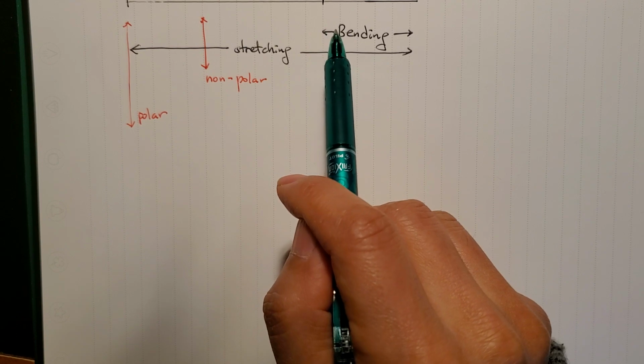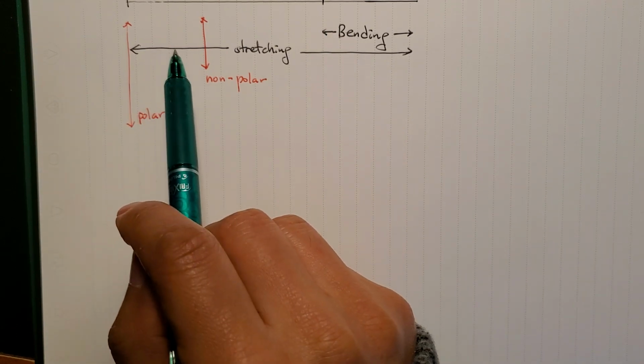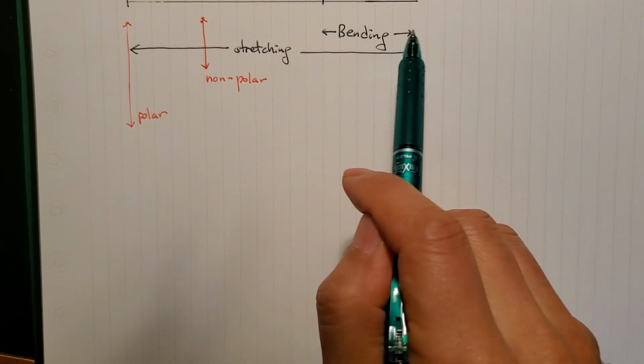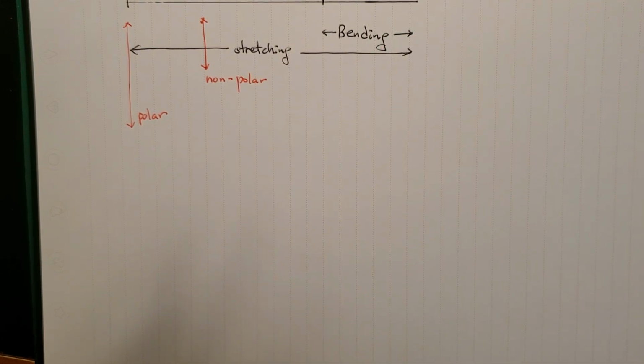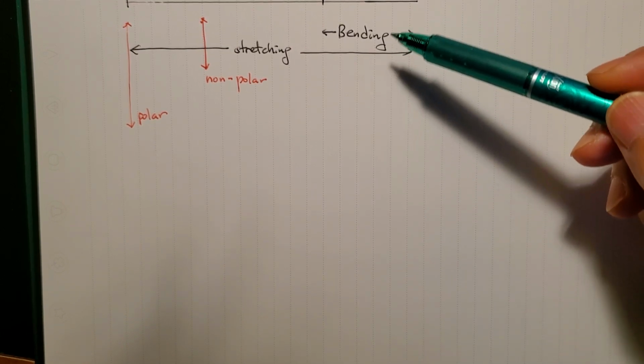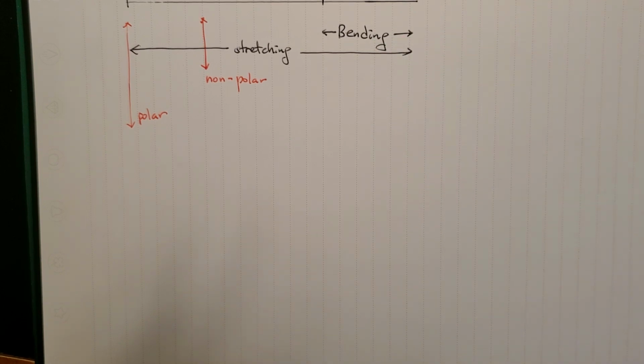The corresponding peaks of the stretchings will be around 3000, right? So here, this area is called fingerprint region, where the bending vibration is showing up with a medium to small size usually, and some of the stretching also comes in this area with a weak intensity.